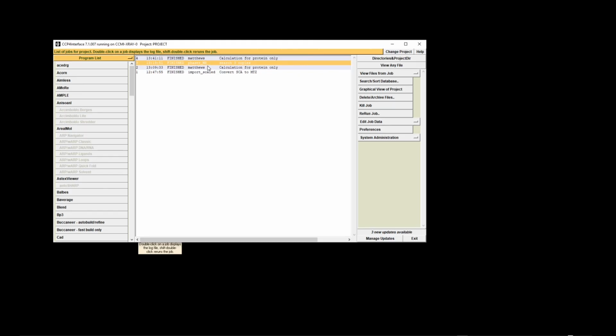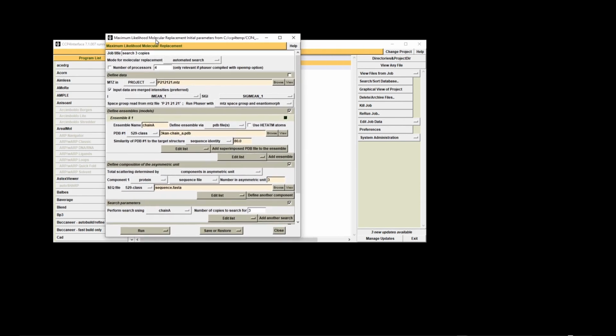So now we'll use a molecular replacement program called Phaser. So basically, what this does is we give it our MTZ file. Now our MTZ file has intensities, which we'll use, but it doesn't have phases. So if you remember when we want to do the electron density calculation, we need the structure factors, which are based on the intensities, and we also need the phase for each HKL. Phaser is going to help us determine phases based on molecular replacement.